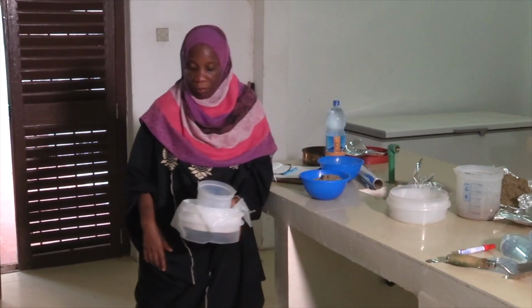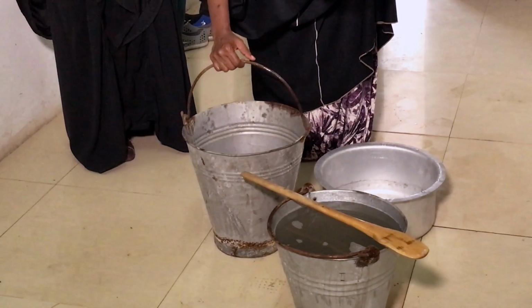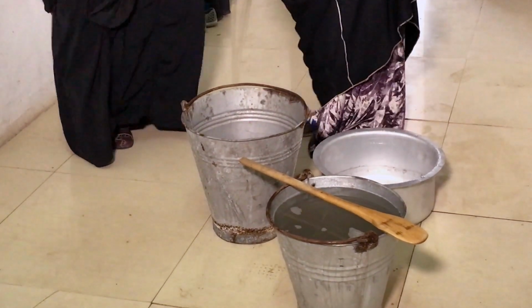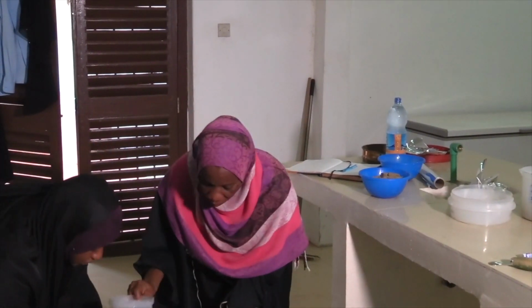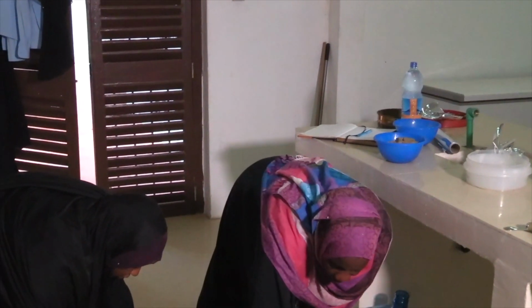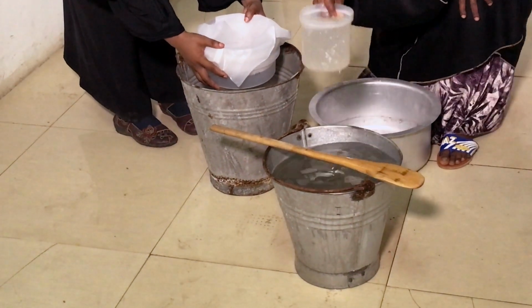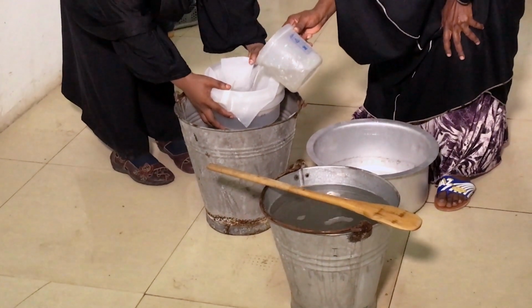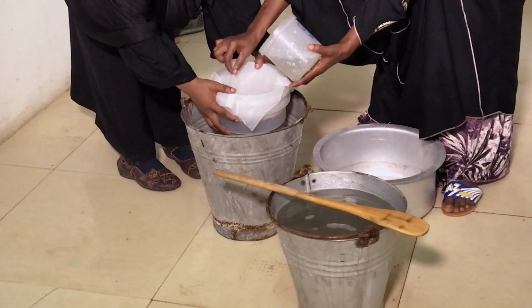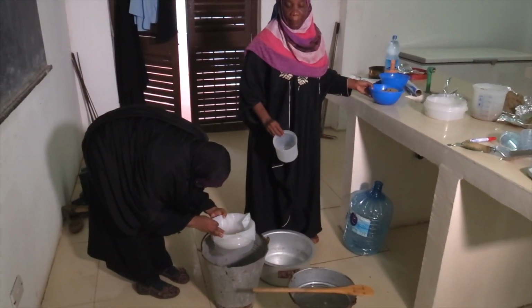So we measure our 4 liters of solution, but we make sure that there are no unneeded particles. So we sieve it using the micro sieve that we have. The 4 liters is enough for our replicate here.